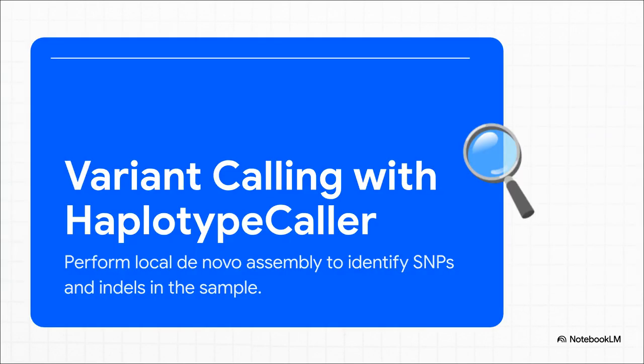So what in the world is haplotype caller? Well, this is the powerhouse, the core engine of discovery. It goes through our beautiful, clean reads and performs what's called a local de novo assembly. Basically, it reconstructs tiny little sections of the genome from scratch. And by doing that, it can spot even the tiniest differences, like single letter changes, which we call SNPs, or even little insertions or deletions called indels.